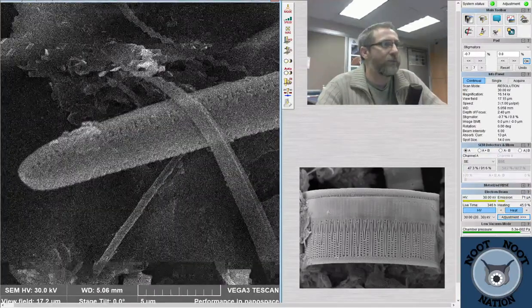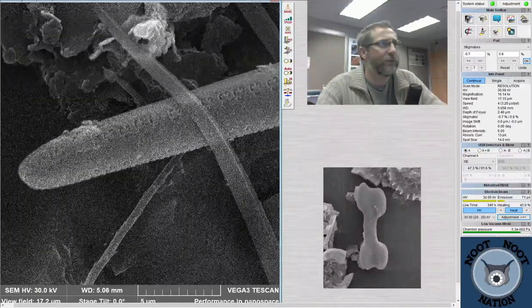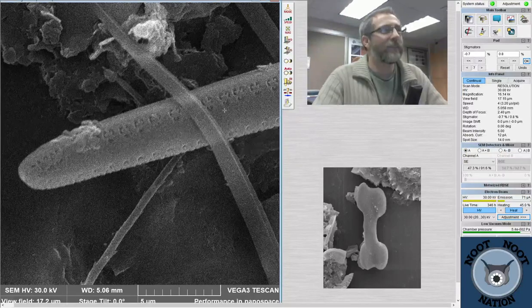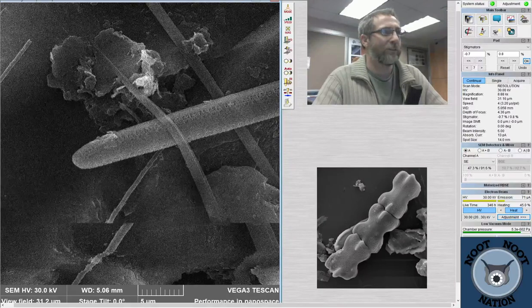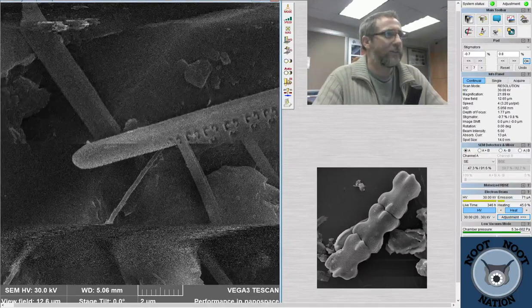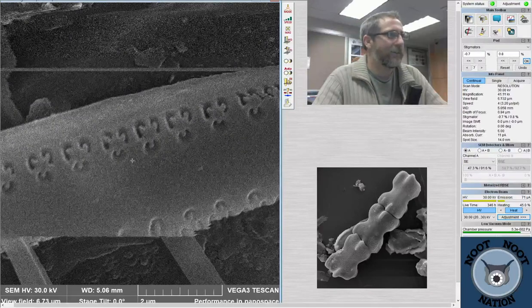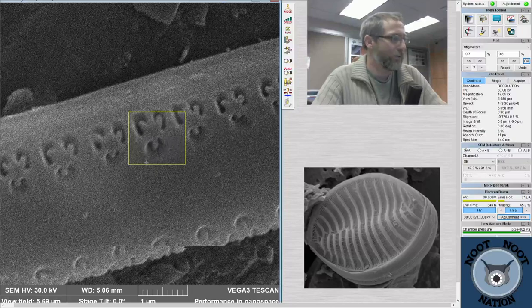And I just want to see what this thing has got going on. It sort of looked kind of cool to me. It's got really weird little pore structures. I could see it even from super zoomed out. I was like, what is going on with that one? It's got really neat little heart-shaped, when you look at them together, sort of pores. Let me get it in focus.